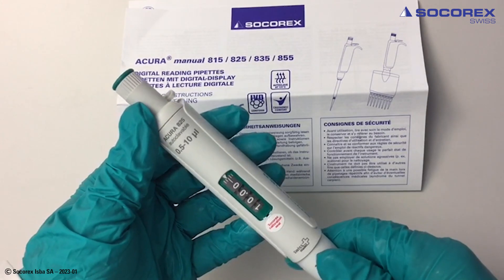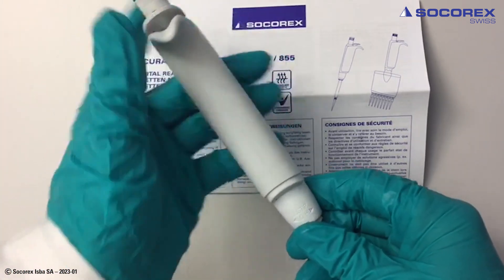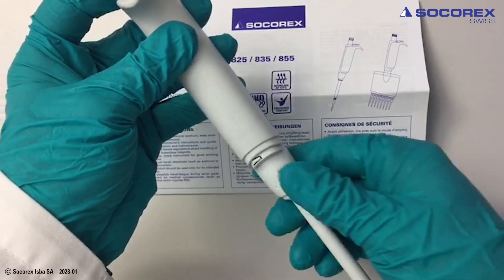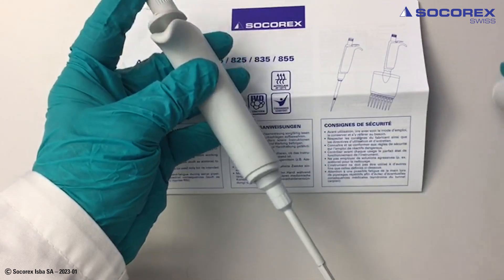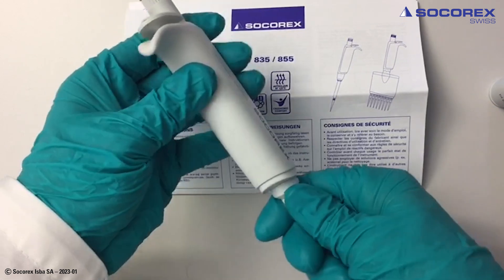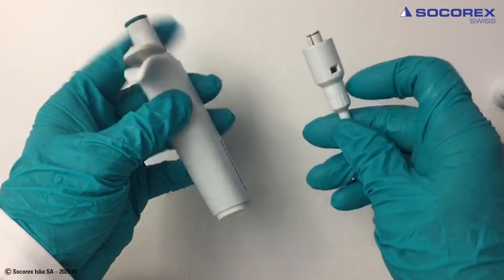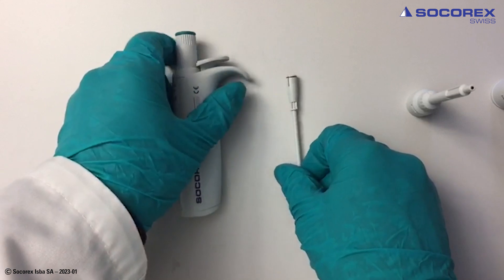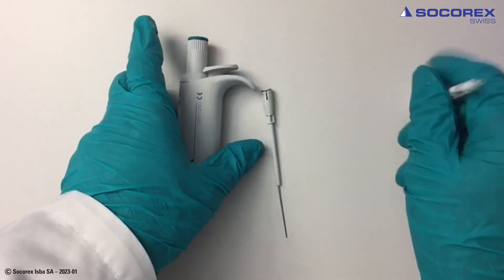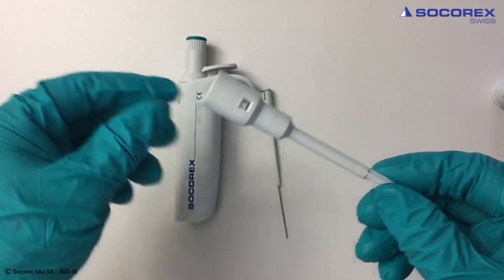In the case of the 10 and 20 microliter models, the O-ring and sleeve are included inside the lower part. Removing the ejector, unscrewing the barrel, removing the plunger, and replacing the entire barrel.